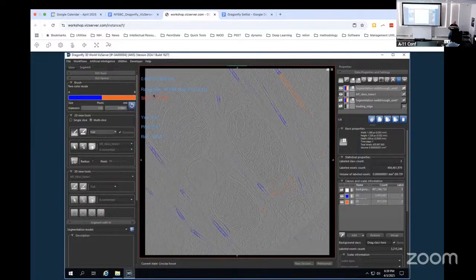Yeah. It doesn't intelligently select all. It's just because the brush is large enough to physically cover that entire area. But if you have a discrete object and you just want to change the class, you could just use a gigantic brush and change all of it. Then it won't be very precise.